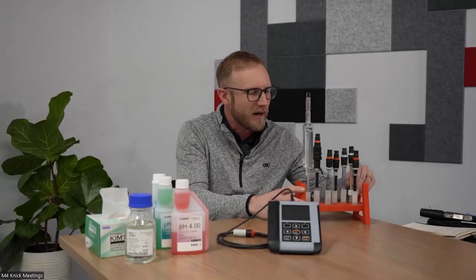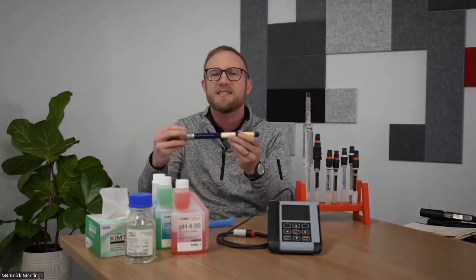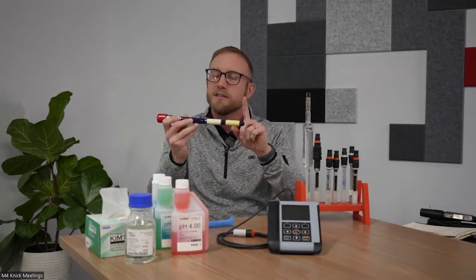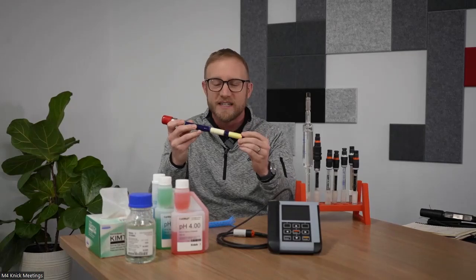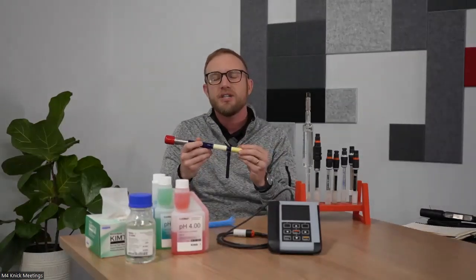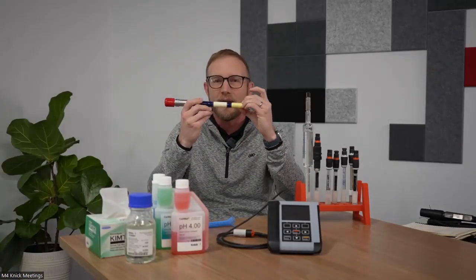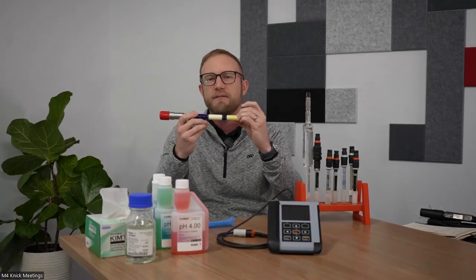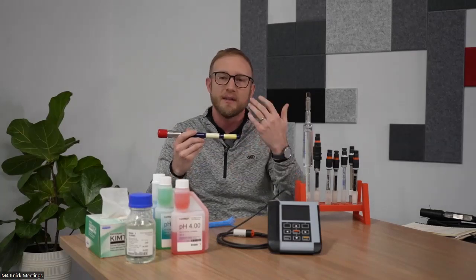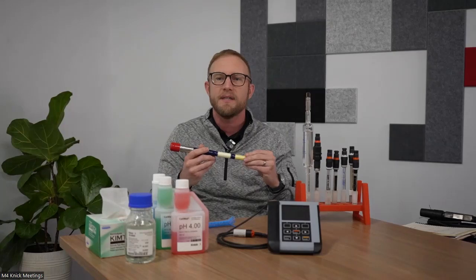And then finally, the last measurement membrane that we'll discuss a little bit is what we call a glass steel enamel electrode. This is a non-glass sensor. It's made of enamel, like the enamel on your teeth. Very chemically resistant, very robust technology. And that enamel utilizes a hydrogen ion sensitive band for measuring hydrogen ion activity within a process. So these particular electrodes have benefits because they can be left dry. Again, they're very robust. They can also handle CIP and SIP cycles.